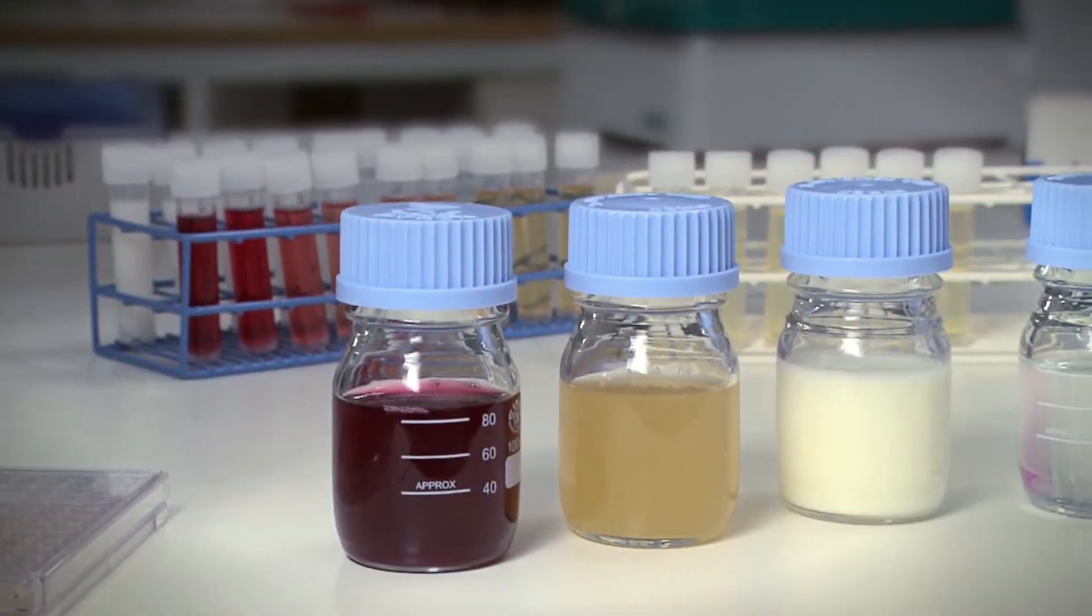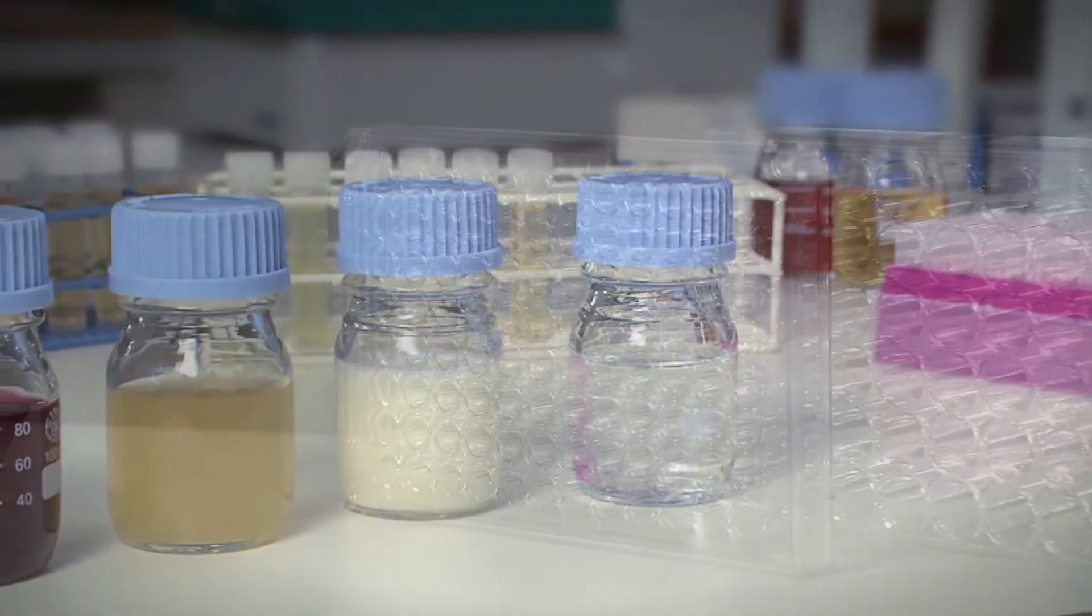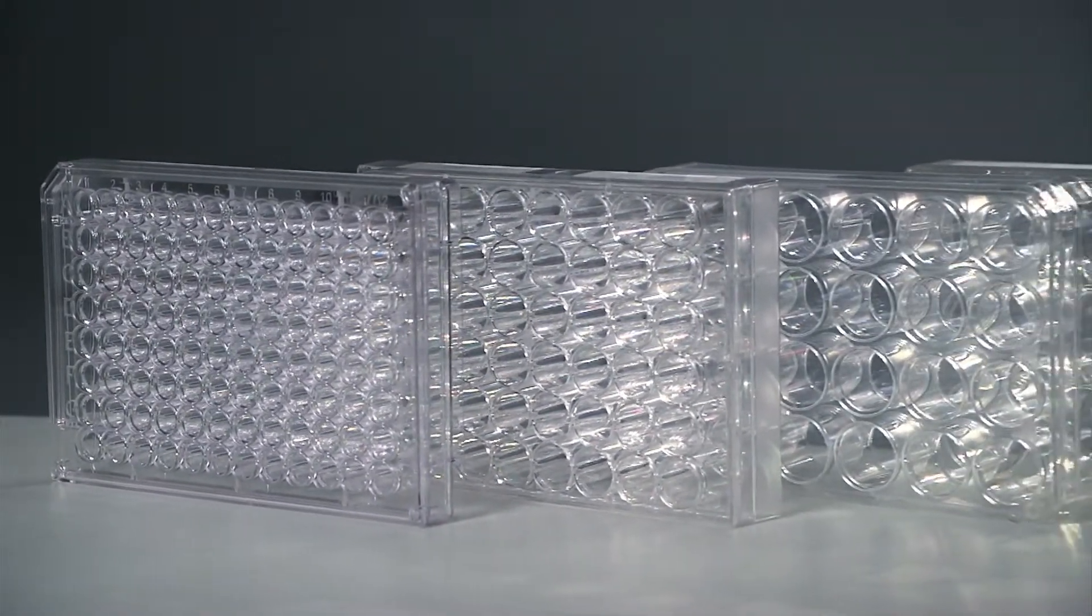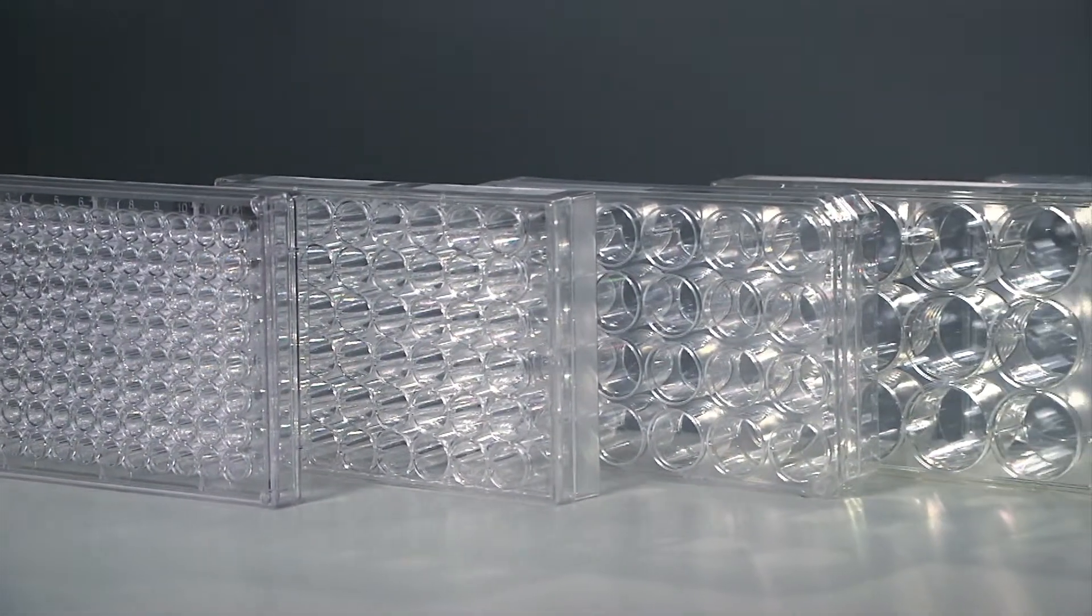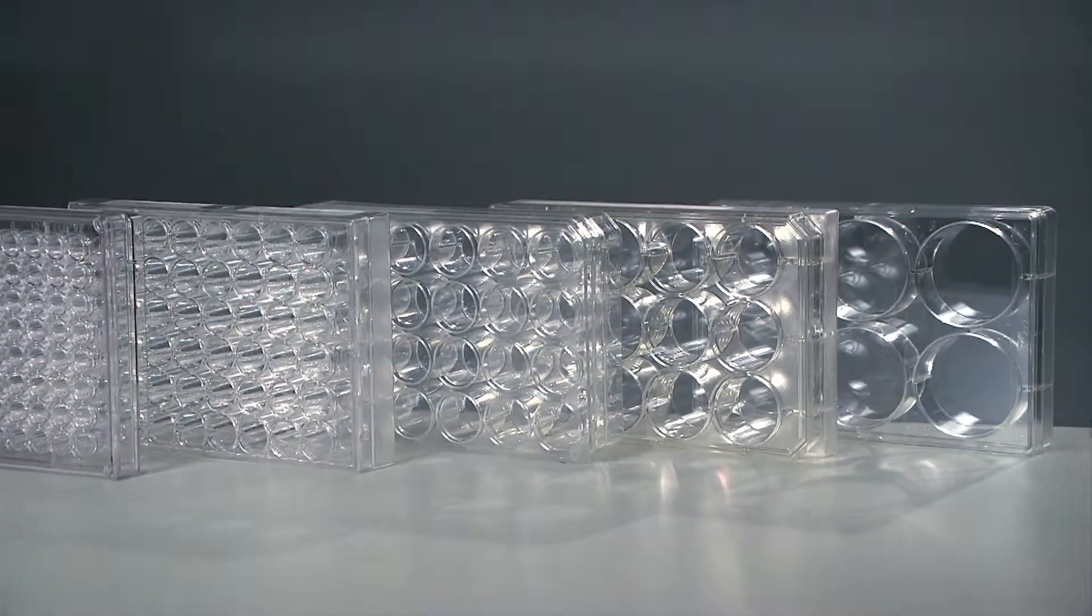Measurements can be taken from various different samples such as blood, urine, milk, and water. Ocelloscope can use standard microtiter plates and supports, for example, 96, 48, 24, 12, and 6 well plates.